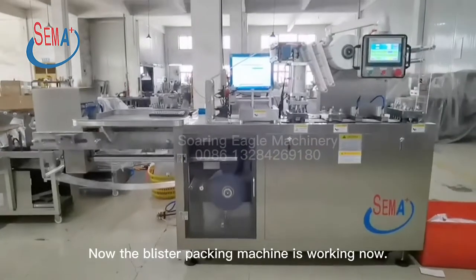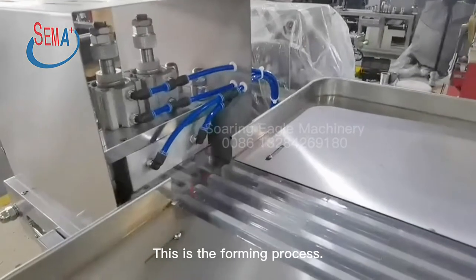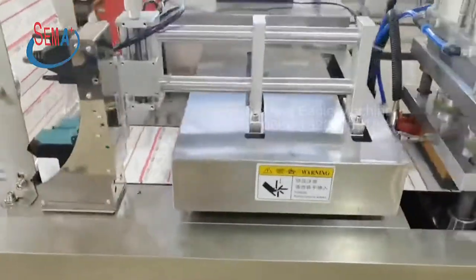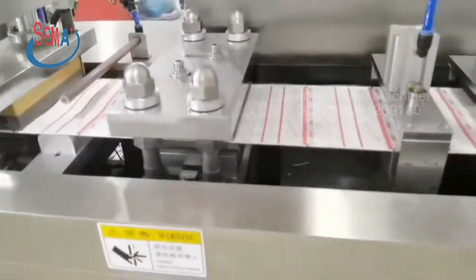Now the blister packing machine is working. This is the forming process — it is fully automatic. After filling, sealing, and cutting, it has been done.